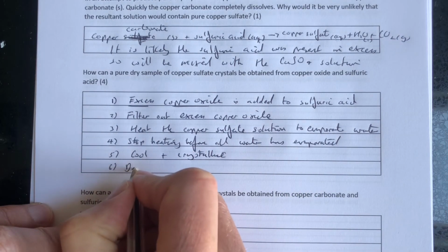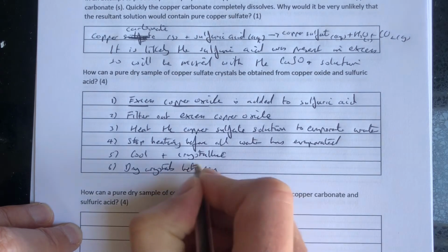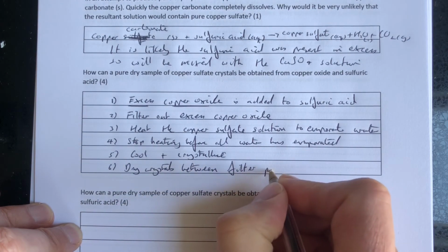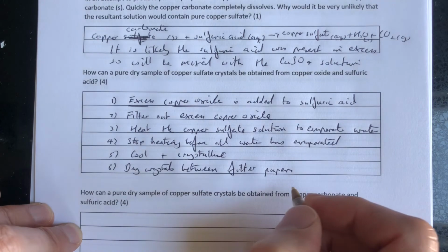6, dry crystals between filter papers. Filter paper is absorbent, so if we use dry filter papers, we can squash the crystals between the filter papers and the filter paper will just take any moisture off the crystals.